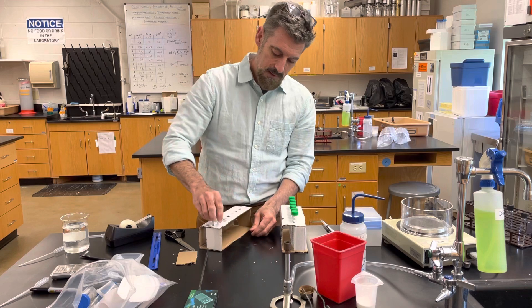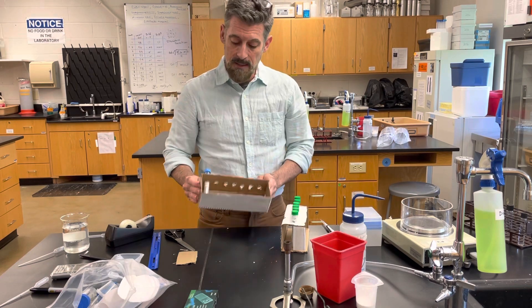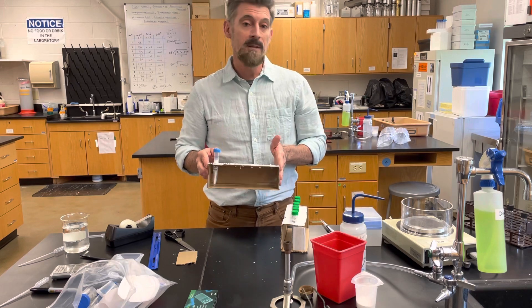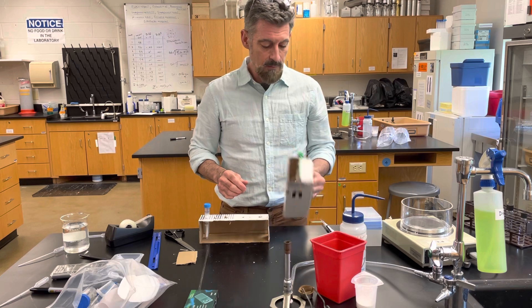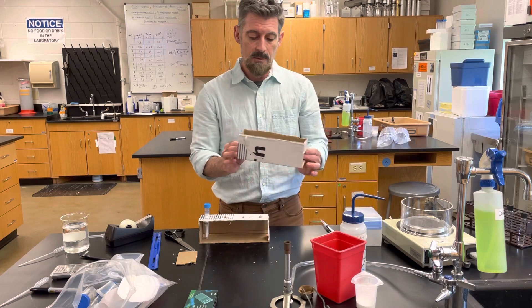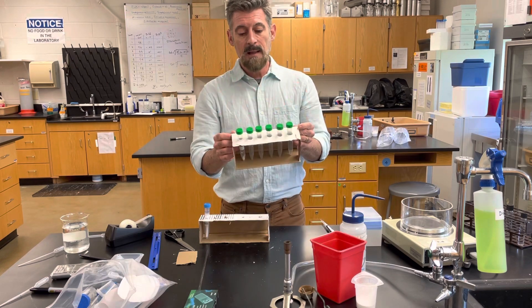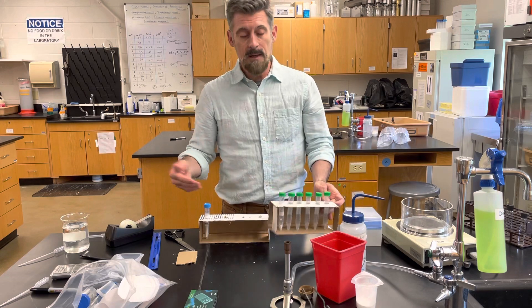Put your test tubes in and it's stable. When you do your next experiment with pipetting, you'll have a test tube rack and you won't be spilling things. You can also reuse it for other experiments. So your next step is this project: build the test tube rack, then use it in the next experiment.